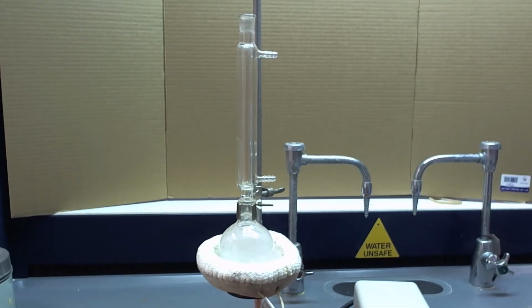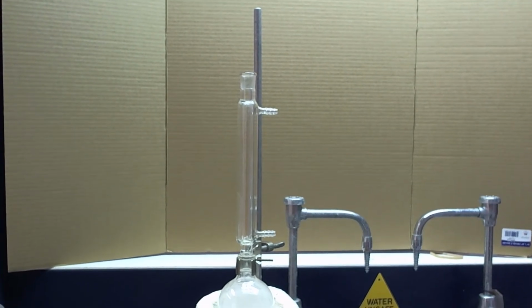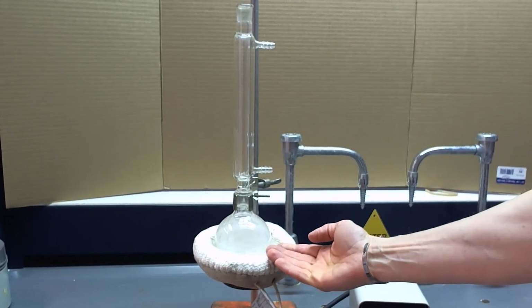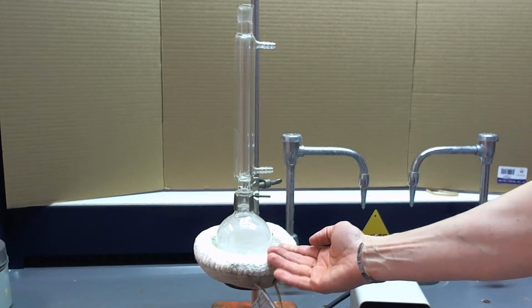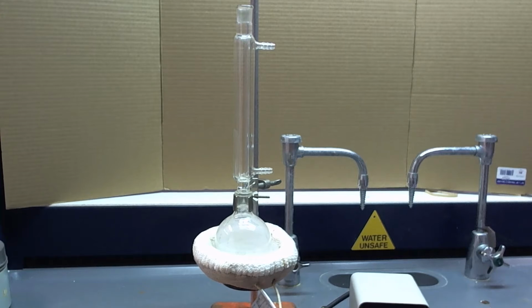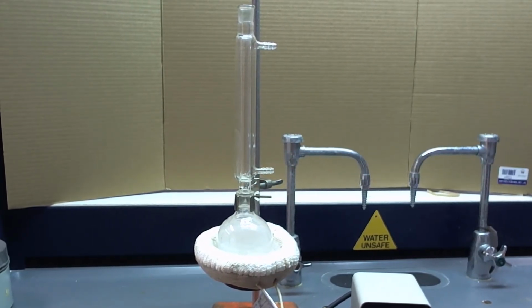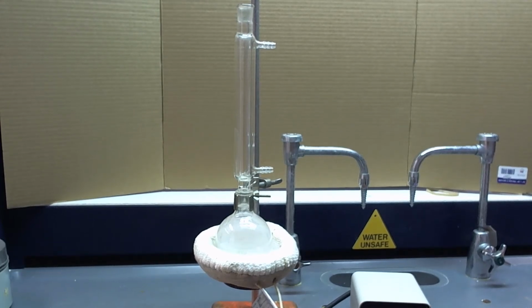Okay. Now if you'll notice, we don't put anything on the top of the reflux condenser. So the idea here is that my reaction flask will heat when I turn on the heat source. The mixture will boil, vapor will go up, and then if we put cold water in the outer jacket, the vapor will cool and condense. So before we turn the heat on, we need to connect this reflux condenser to cold water.